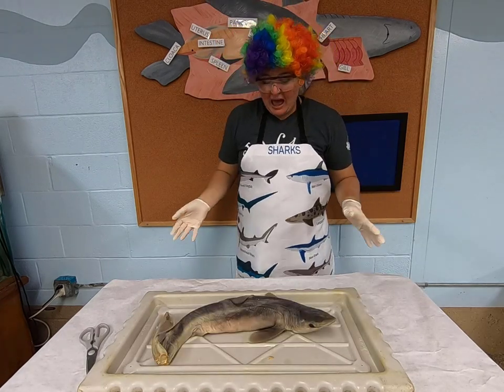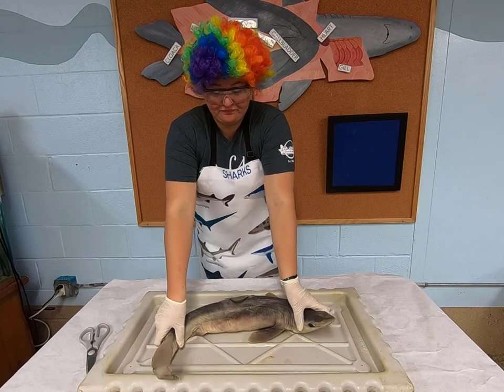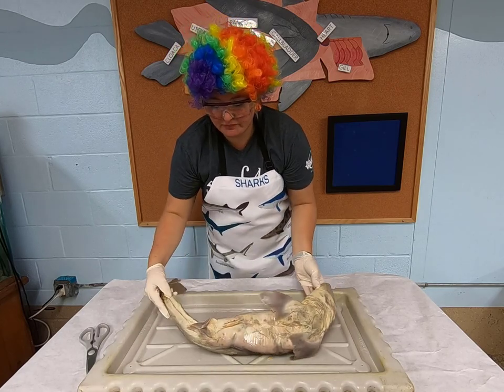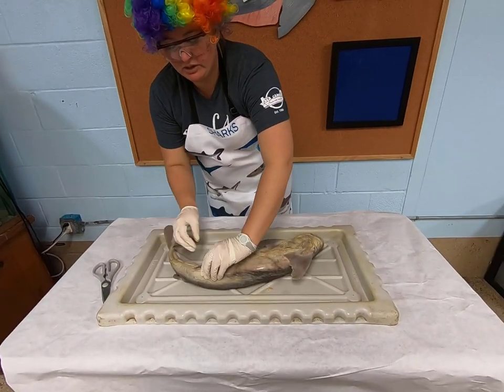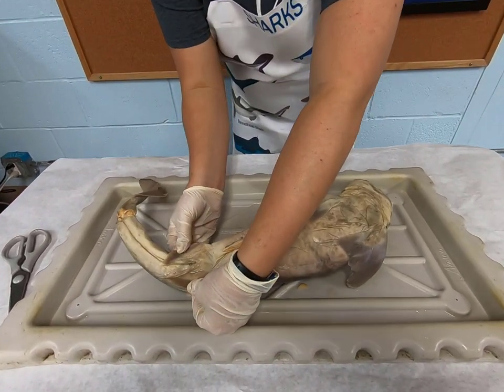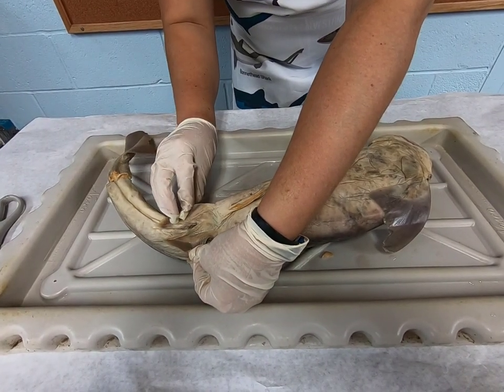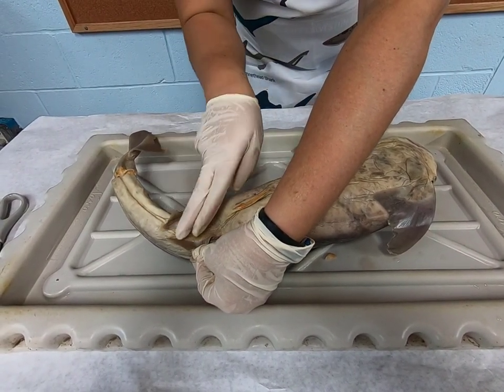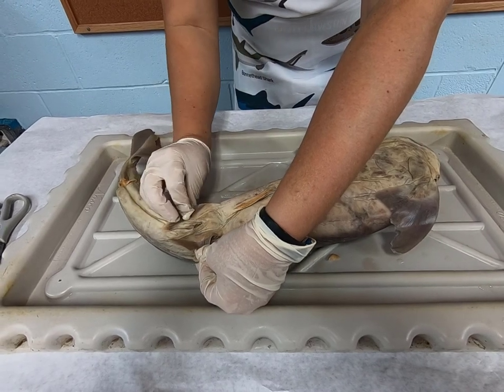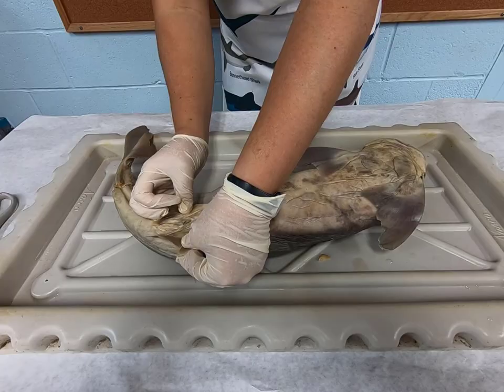So, we have our pectoral fins, dorsal fins, caudal fin, and now, we have our pelvic fin. So we either have pelvic or anal fins. They're right here at the back. Now we have a female shark. If it were a boy, and I'll show you a boy in just a second, it would have two claspers, two finger-like projections on the fins. These pelvic fins help with reproduction.